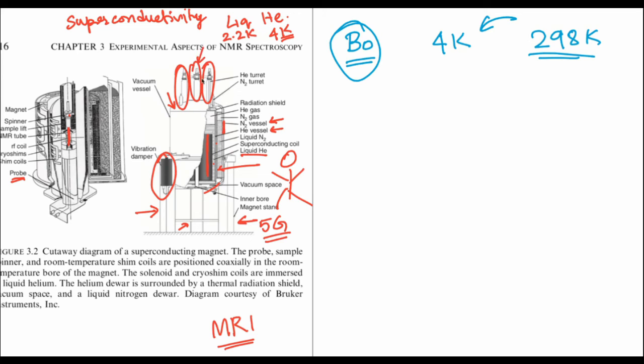I think one will be for helium, the two others for nitrogen. Nitrogen will escape in one, and the other will be filling every week. On the other hand, you will also have a helium port where you will insert helium and the helium can exhaust through the other one. Okay, so one has to be very careful handling the instrument. Don't touch things that are not required to be touched.